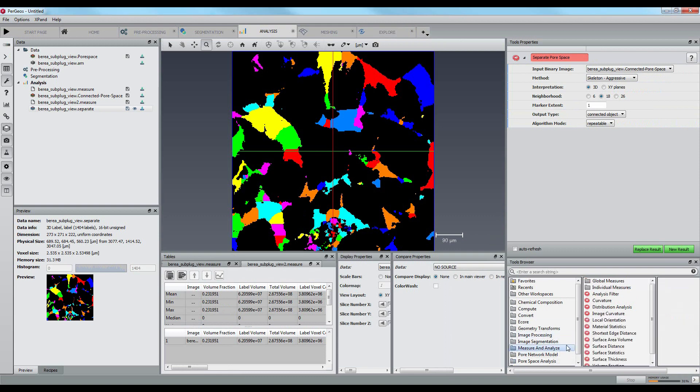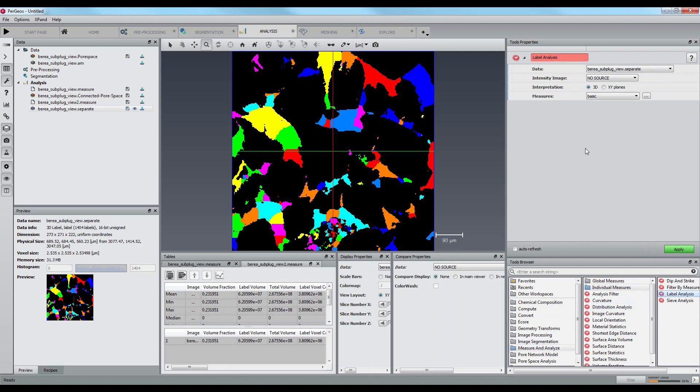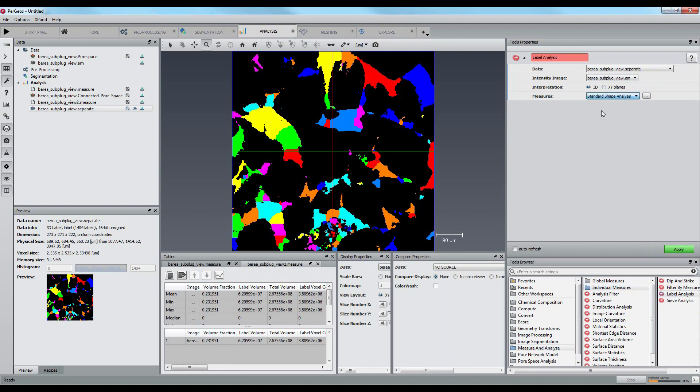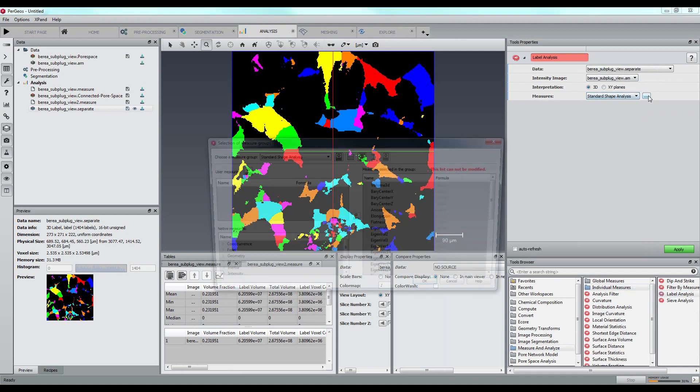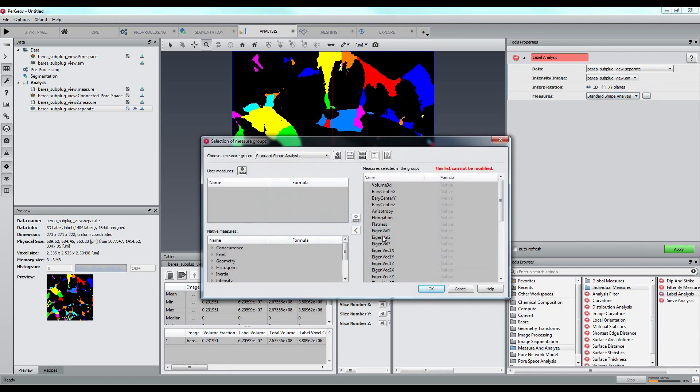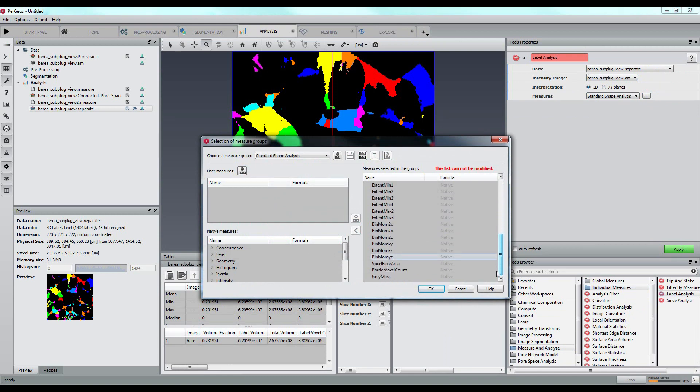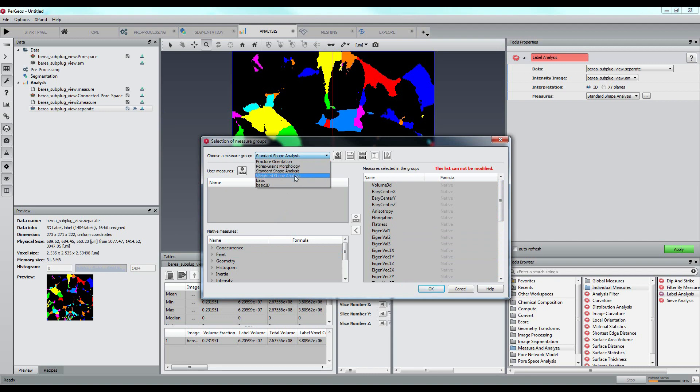The pore size distribution will be obtained after a label analysis. You can see here the list of available measures. We will select pore grains morphology and apply the module.